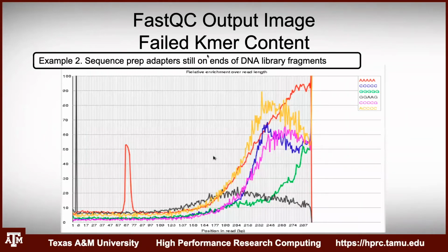Here, the sequence prep adapters were still on the ends of the DNA library fragments. So that's what's causing this enrichment of these particular sequences. And so you just need to trim this off, and then hopefully that will resolve the issue.